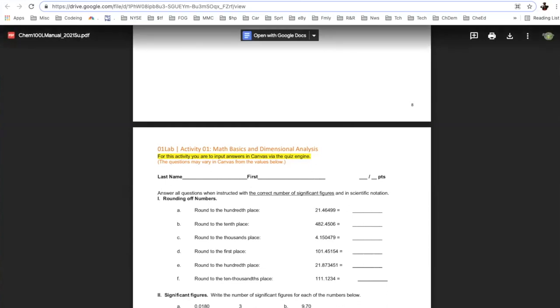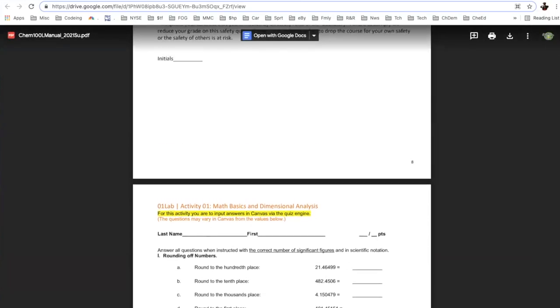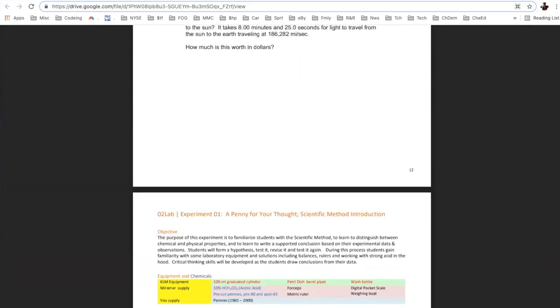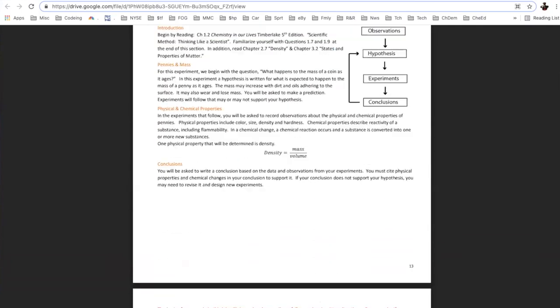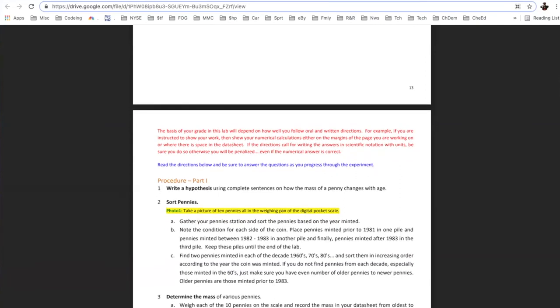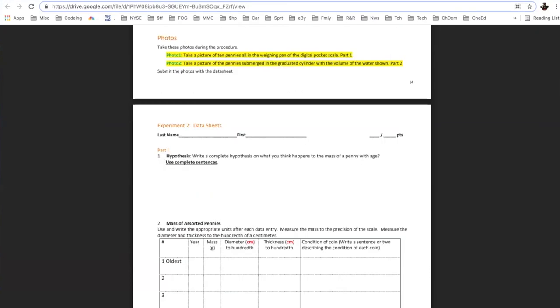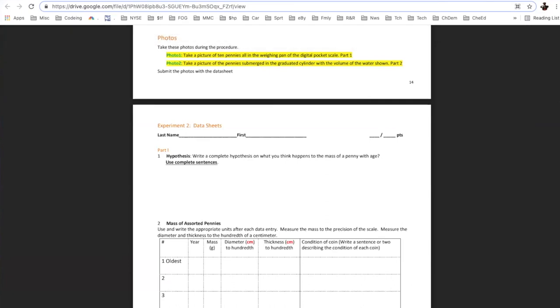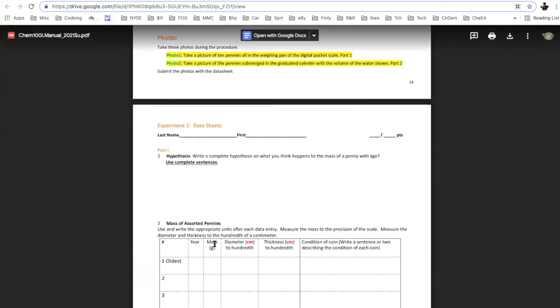Anyway, going back over here, this is a dry lab. See, there are no chemicals that are being mixed or any equipment that's being used. So this is your dry lab. And here's your first experiment. It's called the penny experiment. That's a wet lab in that you have to actually wear your safety goggles, wear your gloves, everything you would do if you were in the lab, okay? And here is the worksheet. Here is what you complete in collecting the data. That's why it's called a data sheet.